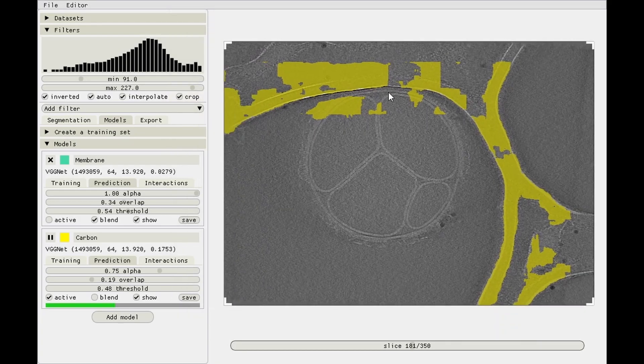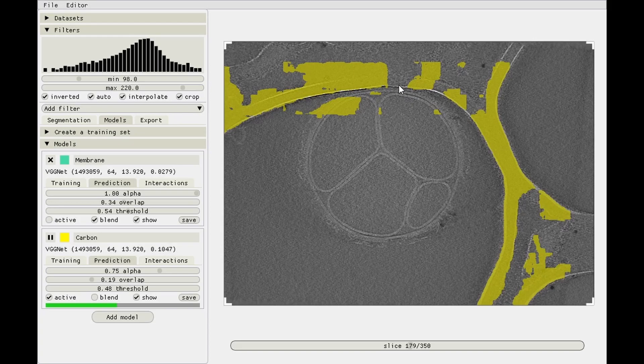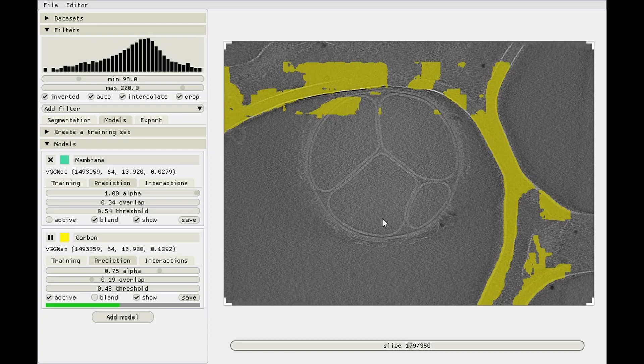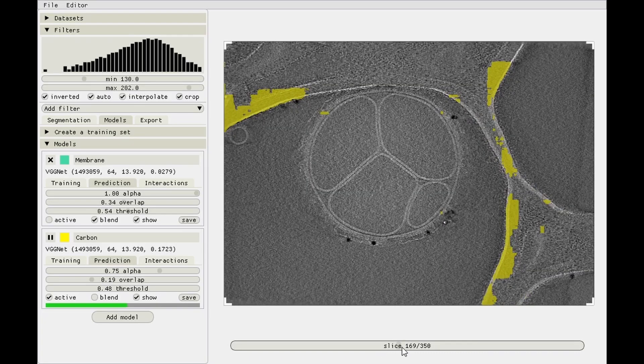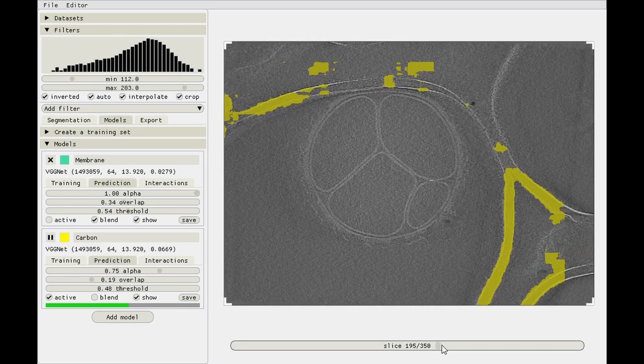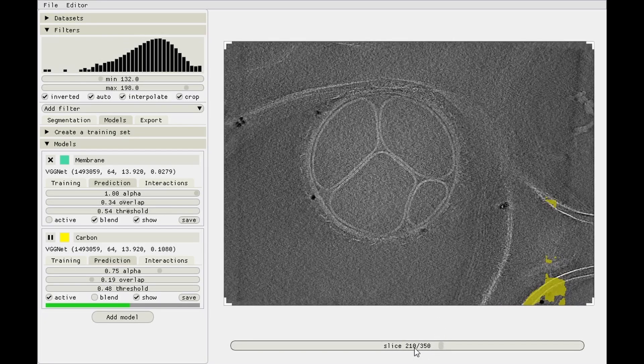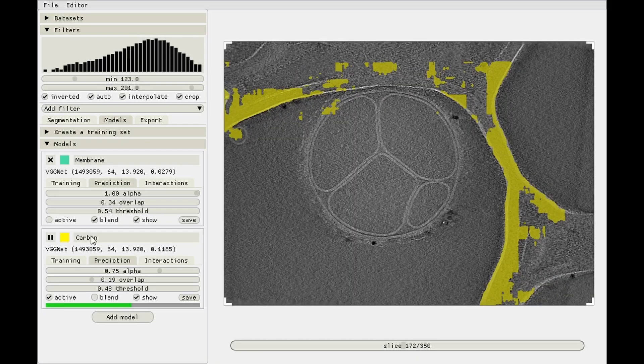But now it's starting to behave fairly well. Still it's predicting membranes closer to the carbon as being carbon, which is unfortunate, but also fine, because usually we're not interested in picking particles close to the carbon anyway because their images are a lot worse than the ones, say, down here at the bottom of the liposome. The loss is still fairly high so we'll wait a bit longer.